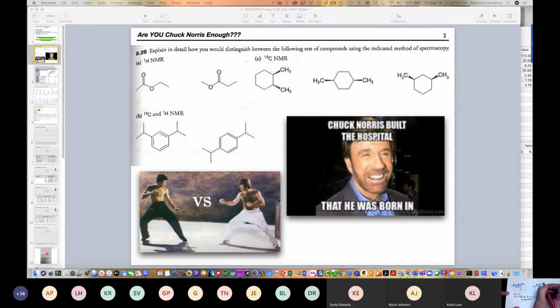So in this one, there are 2 axes, as Ian points out, 2 axes or planes of symmetry. I actually want to say the word axes is fine. Yeah, we'll go with that word. So we can draw here. That's one axis or plane. And then probably why you're not seeing the other one is just how I've drawn the molecule. There's another one here.